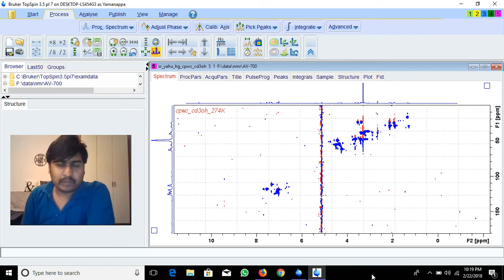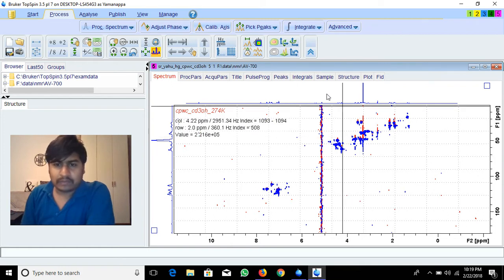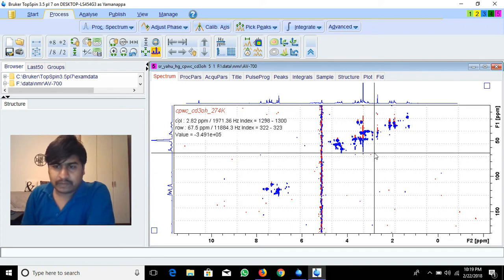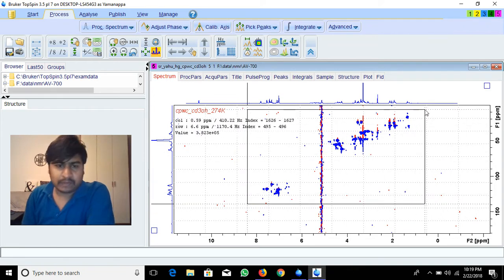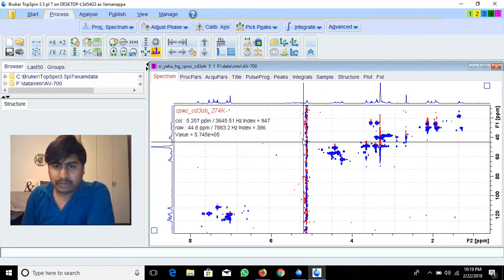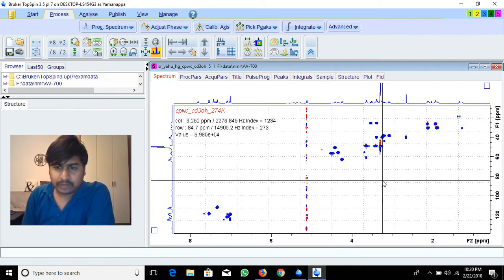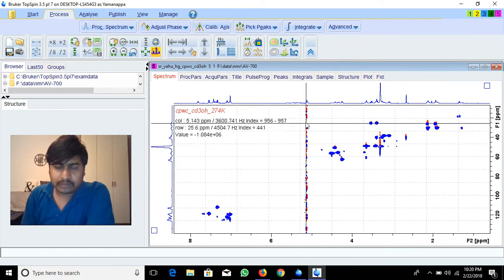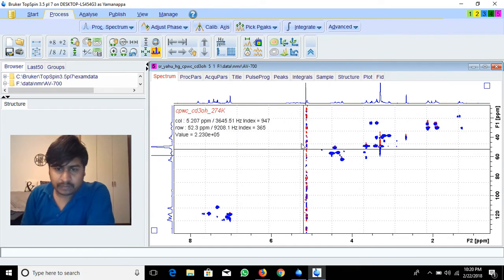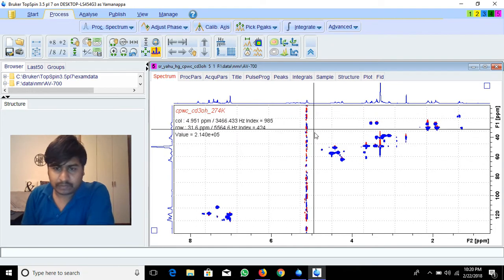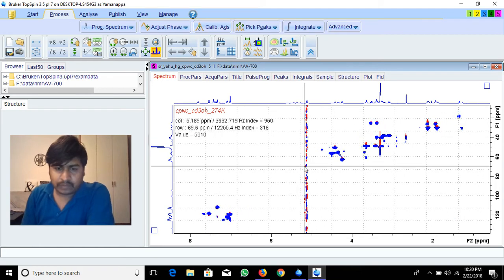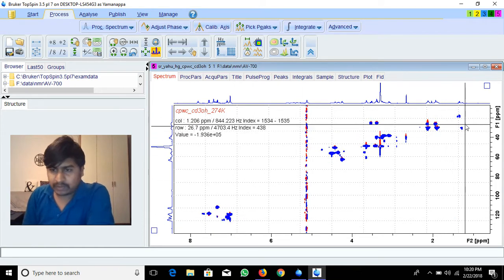In this video I am going to explain how to remove T1 noise and offset noise. For example, I recorded this HSQC spectra in methanol, but when I did the water suppression there is noise — this water suppression peak, this offset noise. If you want to present the whole spectra in any publication or conference, this is not acceptable.